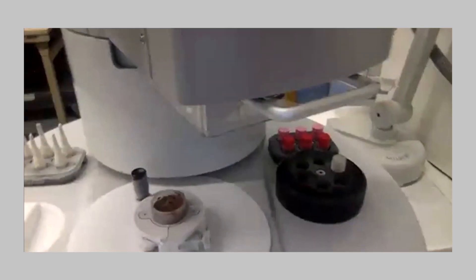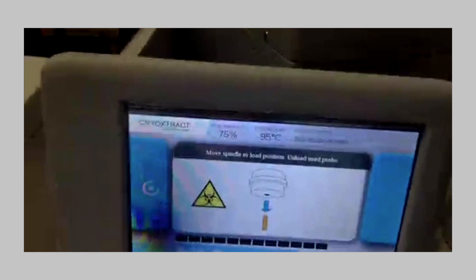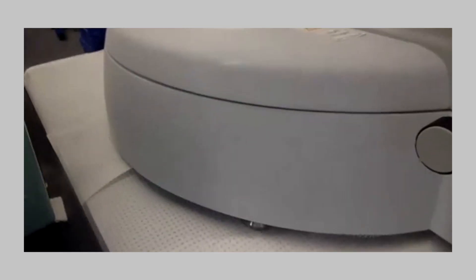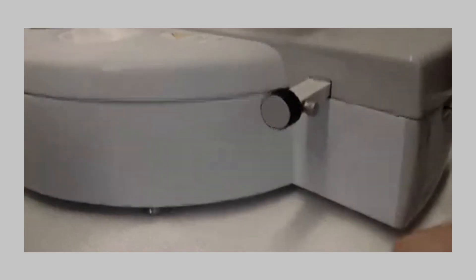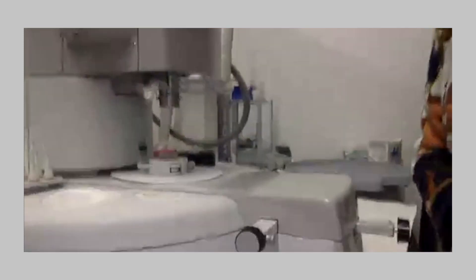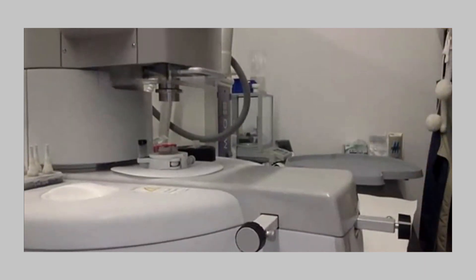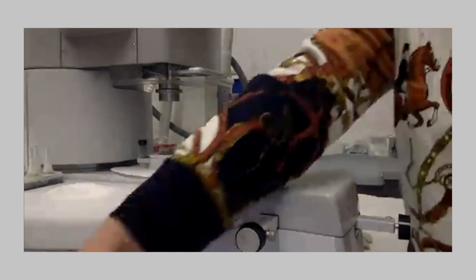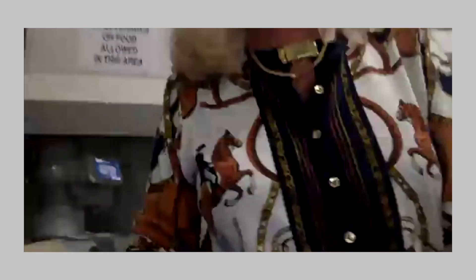As you can see I'm at negative 95°C. It literally took eight minutes to get it from room temperature to minus 80, and I did a core in 60 seconds. And that's it — that's my physical demo. Do we want to open it up to questions?